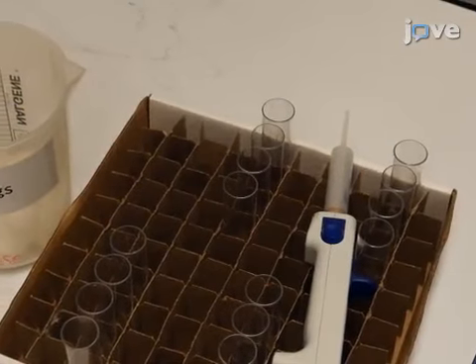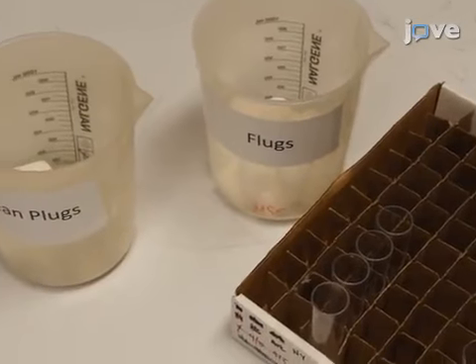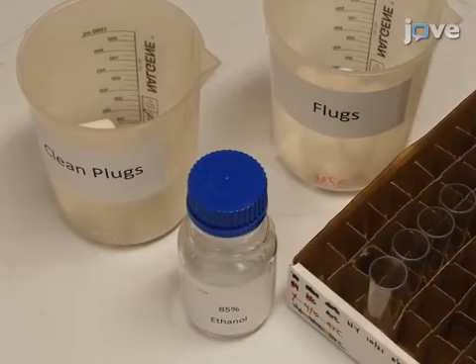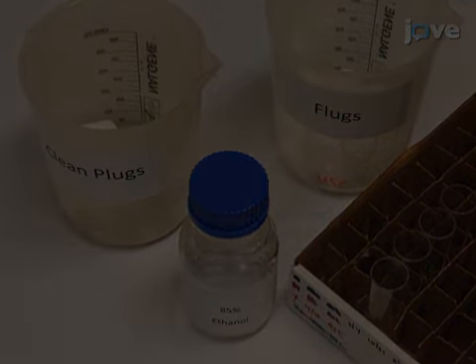Before the assay, prepare a clean, empty food vial which will serve as the testing vial, a new cellulose acetate plug, a silicone stopper, and 1 milliliter of ethanol solution for each vial of flies to be tested.